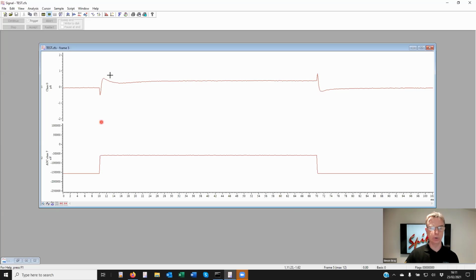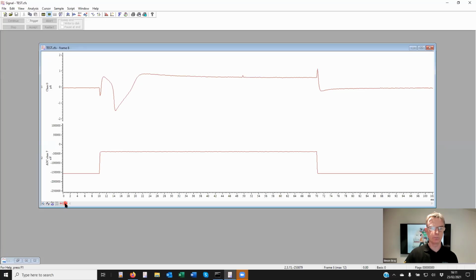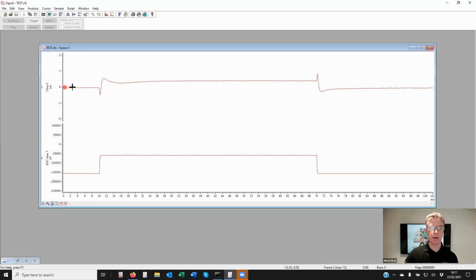And now if we assume that the cell membrane obeys Ohm's law, when the voltage activated channels are not responding, then we can work out basically a resistance curve for the data.